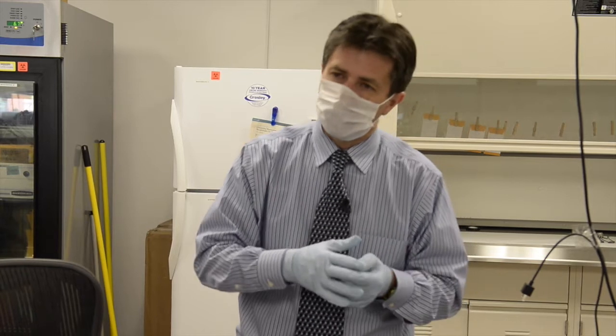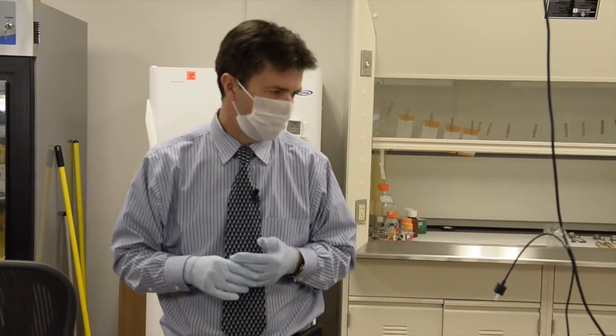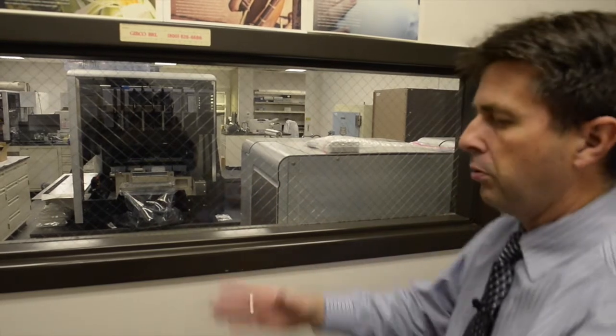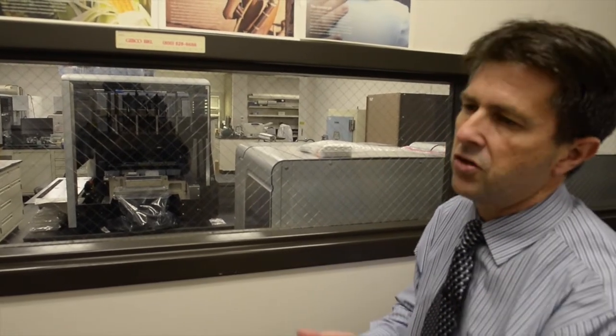The swabs will be cut, put into a rack, so they can be put into one of these tubes and sent off to DNA for testing. At Utah's crime lab, robotics will soon handle the next step. Using a chemical process, the machine will extract the DNA from the sample, clean it, and count how many cells of DNA are present.